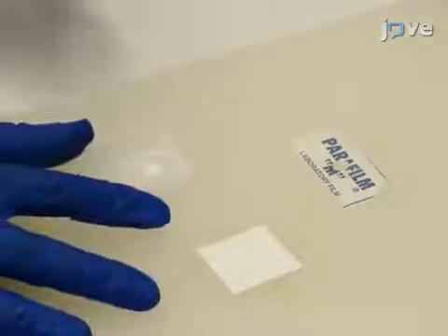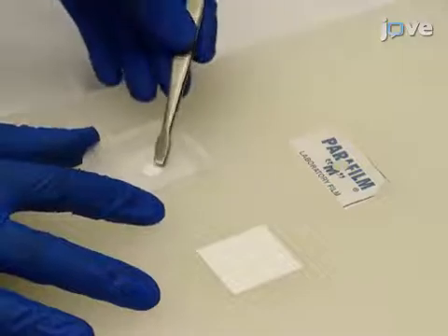To assemble the FINA sample preparation module, use forceps to place the capture disk in the center of the blotting pad.